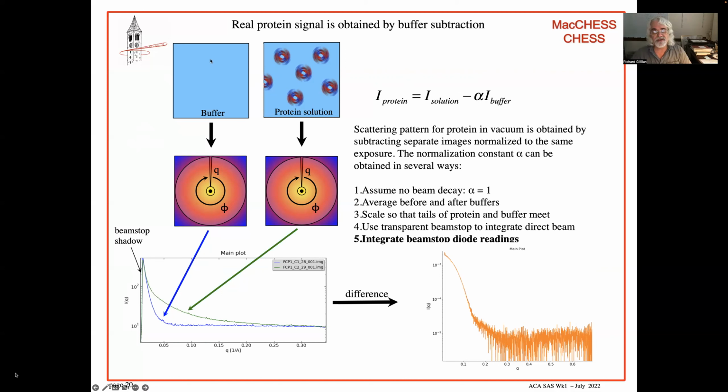And this is a concept that is a little bit foreign to most practical molecular biologists, for whom getting a buffer match is not all that important. Well, in SAXS, it's extremely important to get it precise. You cannot simply mix up buffer that you think matches and expect it to work. A fraction of a percent off, and it will mess up your wide angle signal and your buffer subtraction. So you'll probably hear more of that in a sample preparation lecture later in this workshop.